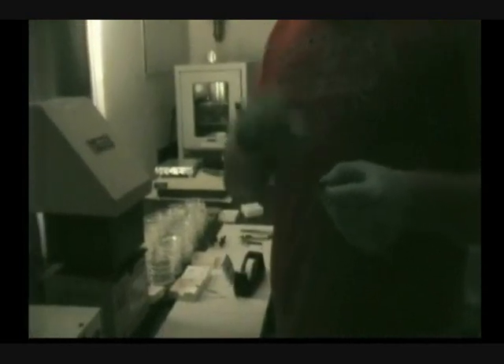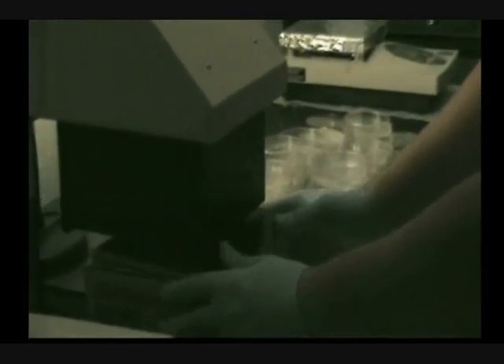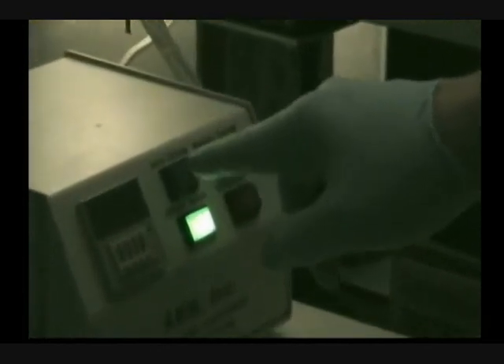I am going to put the mask on top like this and tape it down. This process is also called photolithography — lithography means printout, and photo means we are using light. So we are going to print a pattern on our glass slide using UV light. I am going to place my glass slide under the UV light unit and we are going to apply UV light for 5 to 6 seconds.